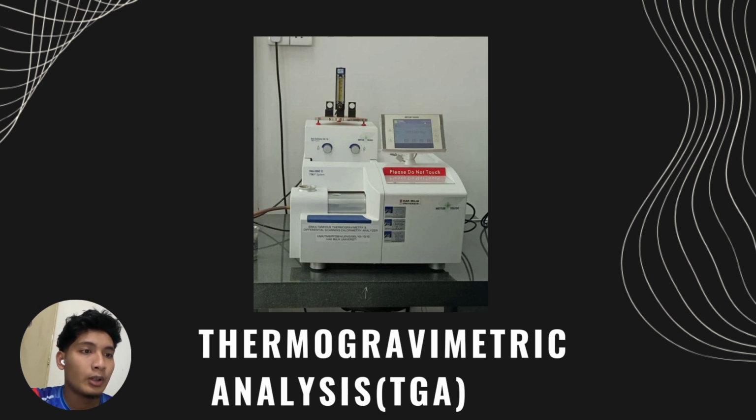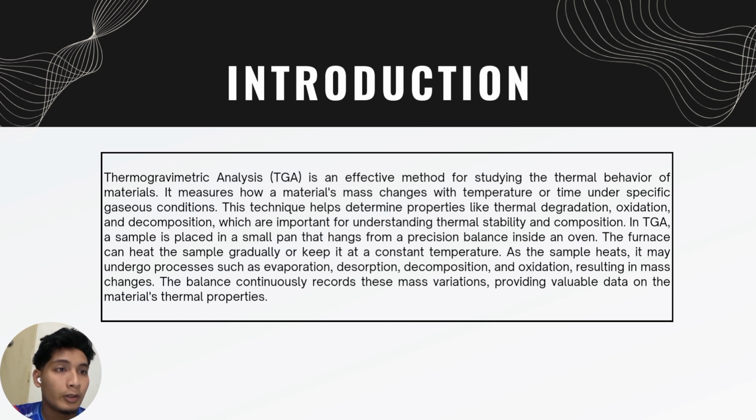This is a picture of thermogravimetric analysis, or TGA. For the introduction, thermogravimetric analysis, or TGA, is an effective method of studying the thermal behavior of materials. It measures how a material's mass changes with temperature or time under specific gas conditions. This technique helps determine properties like thermal degradation, oxidation, and decomposition, which are important for understanding thermal stability and composition.